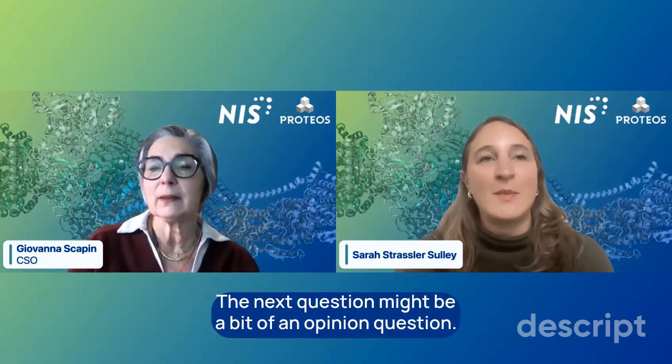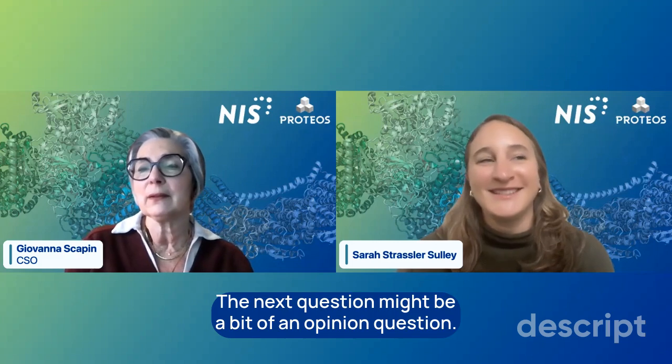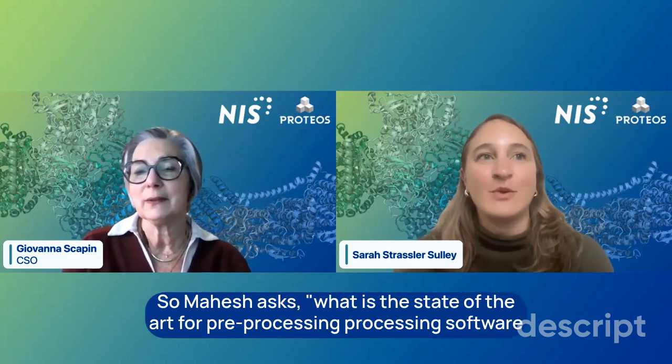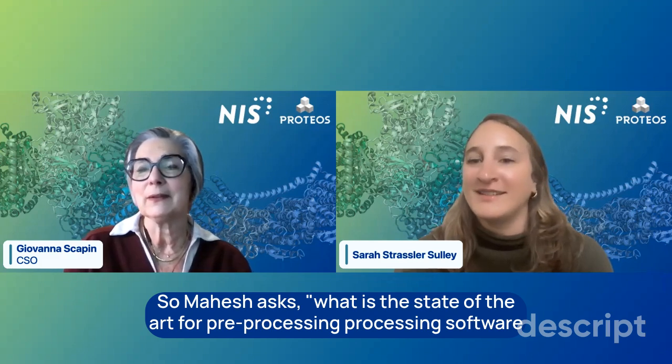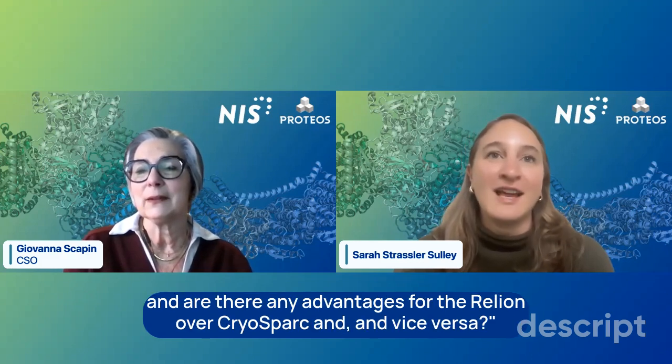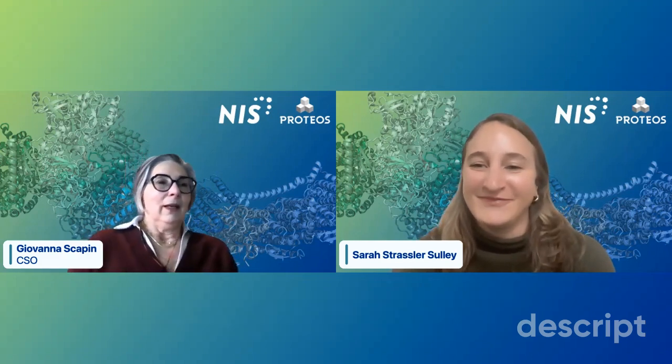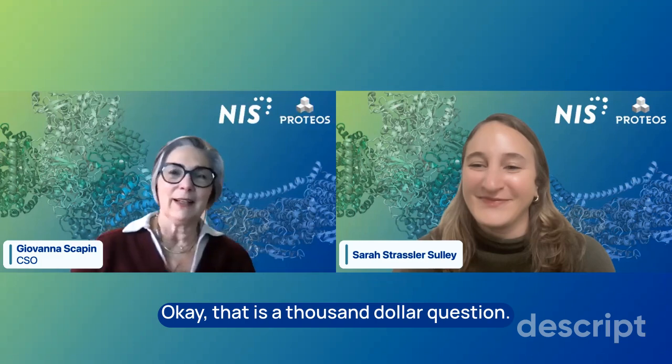The next question might be a bit of an opinion question. So Mahesh asks, what is the state of the art for processing software? And are there any advantages with Relion over CryoSparc and vice versa? Okay, it's a $1,000 question.